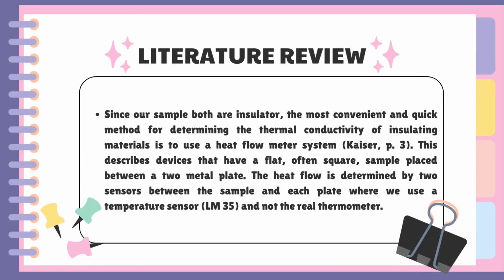And we use Lee's method to determine the thermal conductivity. Since our samples both are insulators, the most convenient and quick method for determining the thermal conductivity of insulating material is to use a heat flow meter system. So this describes a device that has a flat, often square sample placed between two metal plates, and the heat flow is determined by two sensors between the sample, and each plate will use the temperature sensor, which is LM35, and not the real thermometer.